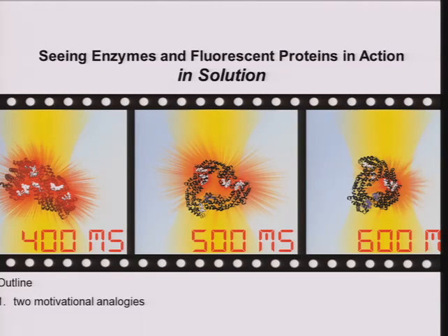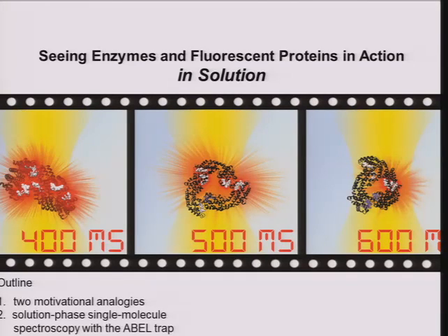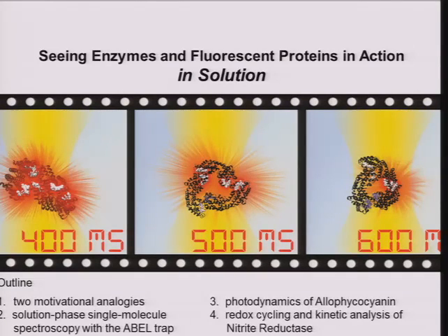I'm going to assume that over the break, everyone has forgotten all of the wonderful reasons to do single molecule measurements. So I'm going to remind you with two fairly ridiculous motivational analogies. I will, again, build the case for the use of this device for doing solution phase single molecule microscopy and spectroscopy. And then we'll be talking about applications of that device to two systems, a photosynthetic antenna protein called Allophycocyanin and an enzyme called Nitrite Reductase.